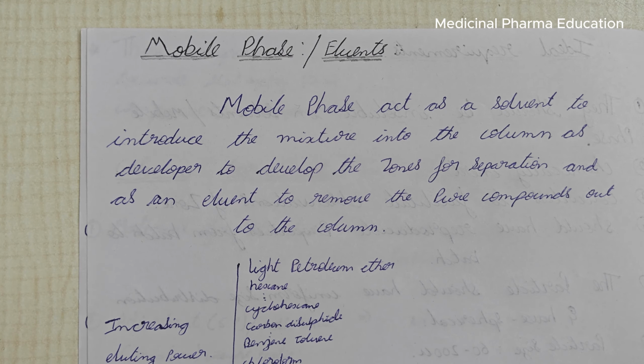Mobile phase is what moves through the stationary phase, flows through it, and carries the sample. Based upon the attractions towards the stationary phase, the sample is separated.